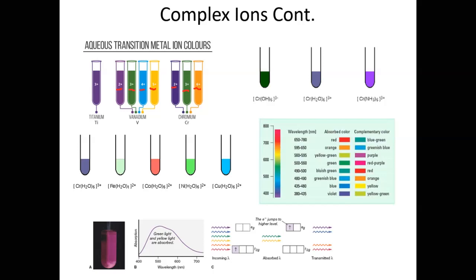So again, the color absorbed is opposite the color it appears as.